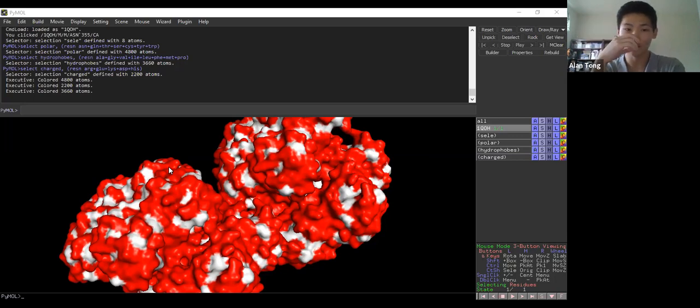So typically, if, for example, it's an enzyme, then we'll know previously what the enzyme does. So for example, DMJ-HAMT, we know that it catalyzes the formation of biofuels, but the question is how? And so I want to zoom in. Of course, I can't show you guys because I don't have the structure, right? But if I were to zoom in on the active site of that enzyme, then I can actually look at what amino acids are important for coordinating that reaction. And I can mutate this to maybe another amino acid to optimize, hopefully.